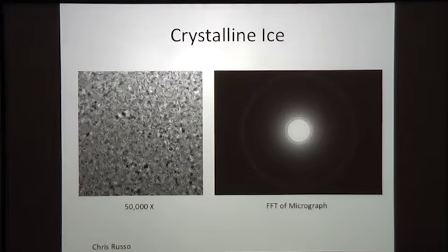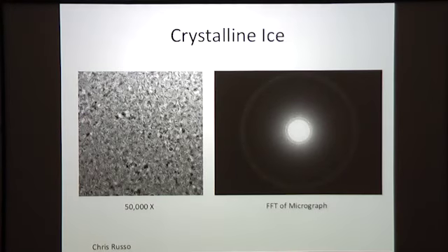At higher magnification, it'll be very obvious. You will see an ice ring at around 3.6 angstrom, and your background will be quite dirty. You won't be able to see your particles. So this is really not usable.